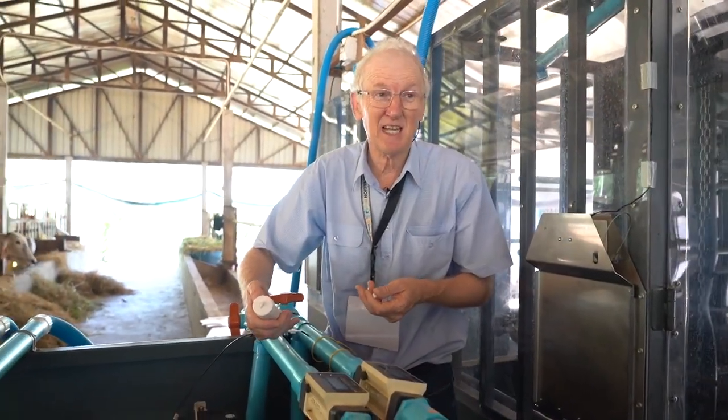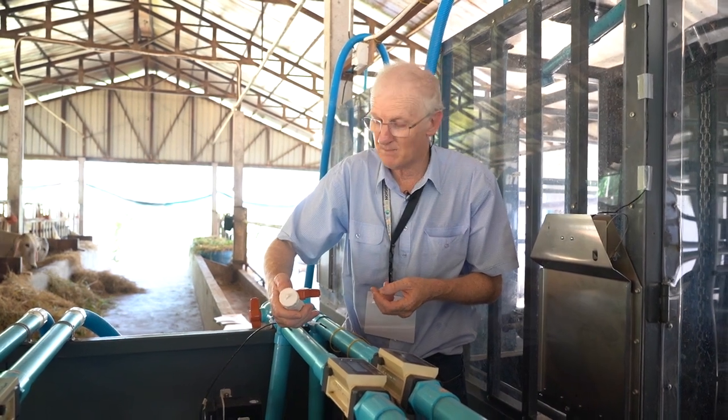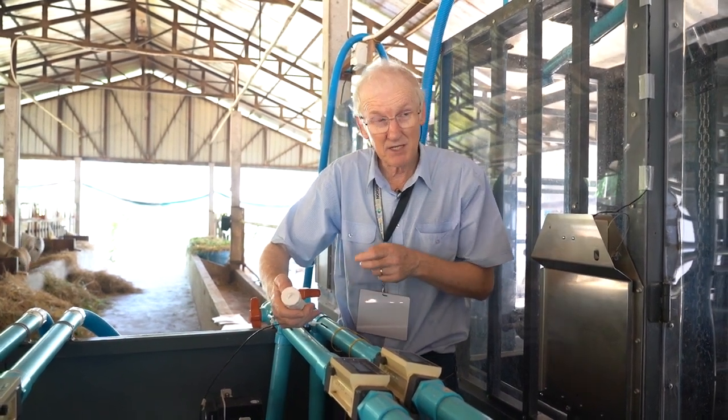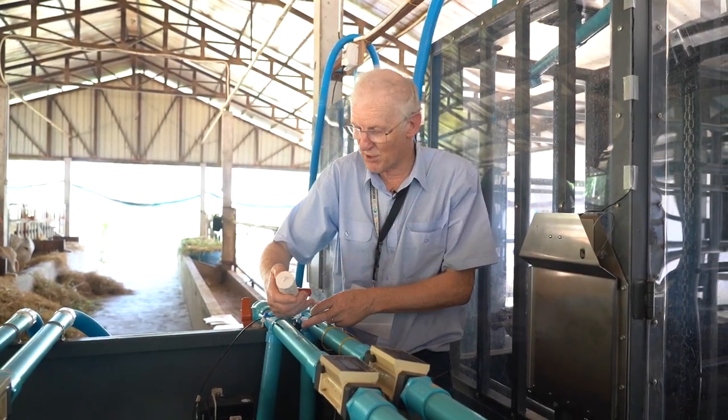Particularly if you're close to sea level, it's generally not very far away from 100 kilopascals. But we need that exact measurement to get the exact methane production rate. So always get our temperature, always get our pressure.